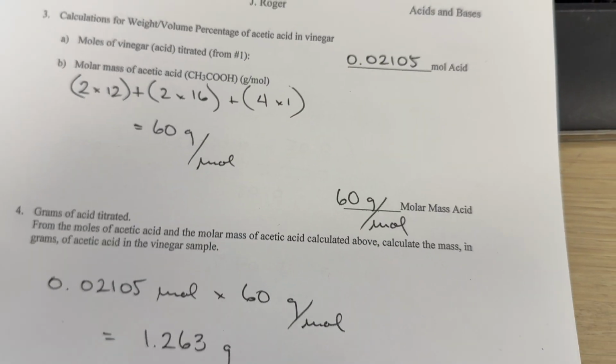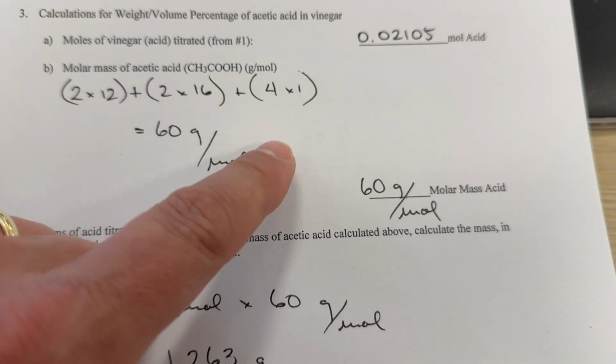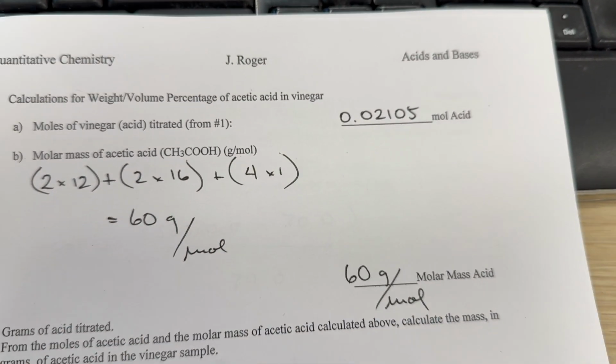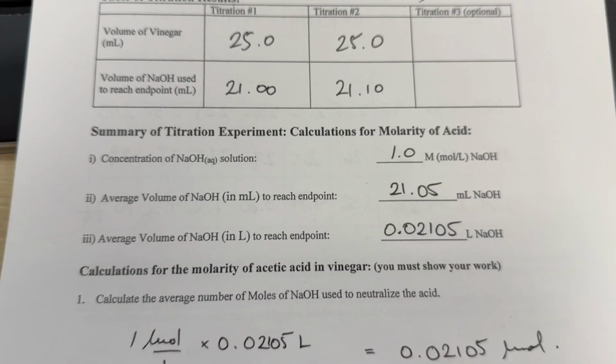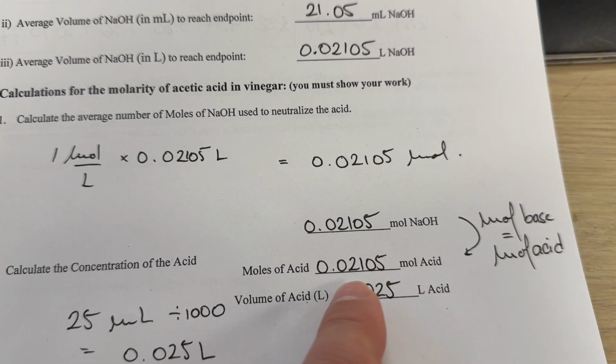So what we need to do is go on here. We're going to find the number of moles of acid that we previously found over here. The moles of base were equal to the moles of acid, so 0.02105.